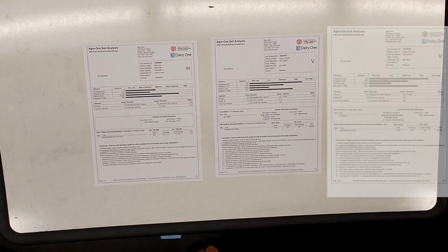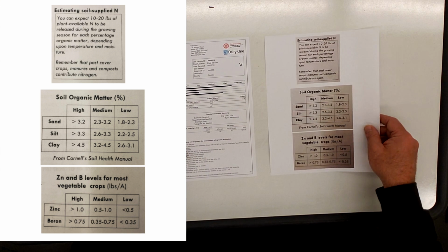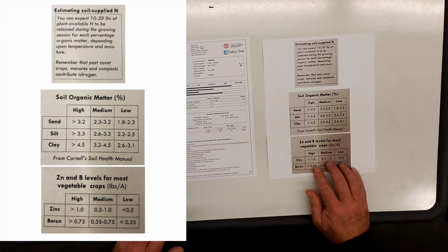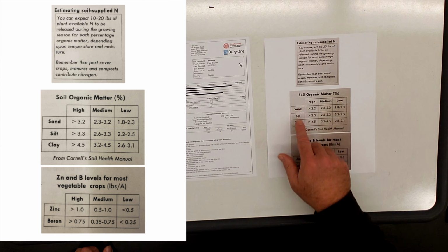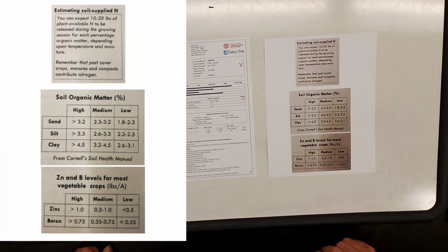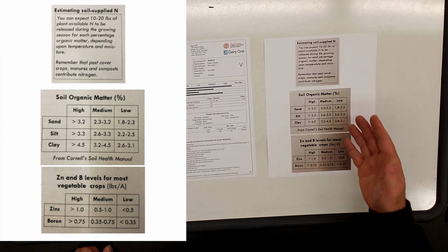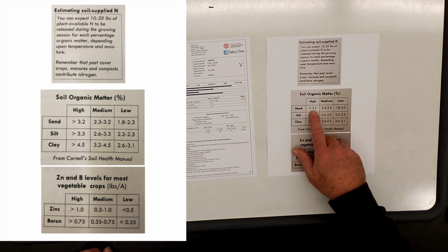Just to give you a ballpark, I've got a little table here. This is from the Cornell Soil Health Lab, basically out of their manual. If you look at this chart right here, at your soil textures, sand versus silt versus clay, they give you a ballpark of what their percentages actually mean. So with the sand, if you're below 2.3% organic matter, you probably have a fairly low organic matter for your sand. Again, if you're above 3.2, it's probably pretty high.